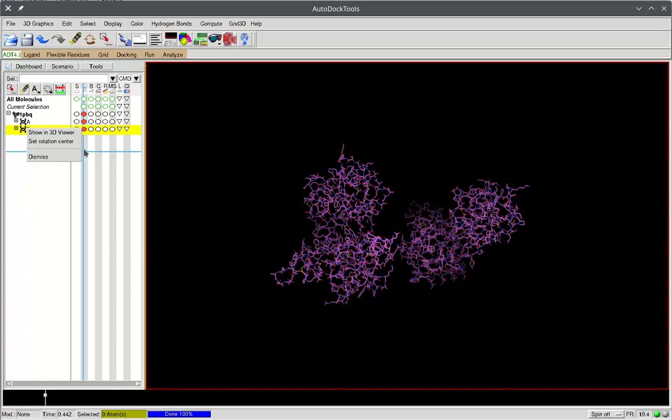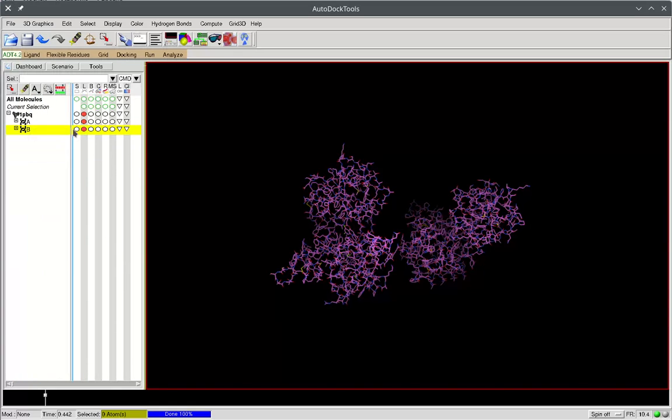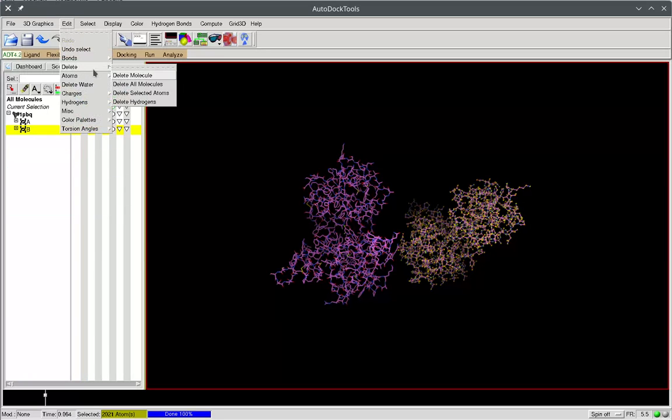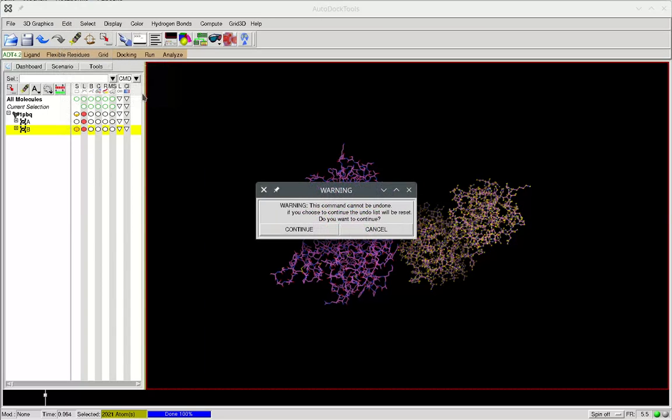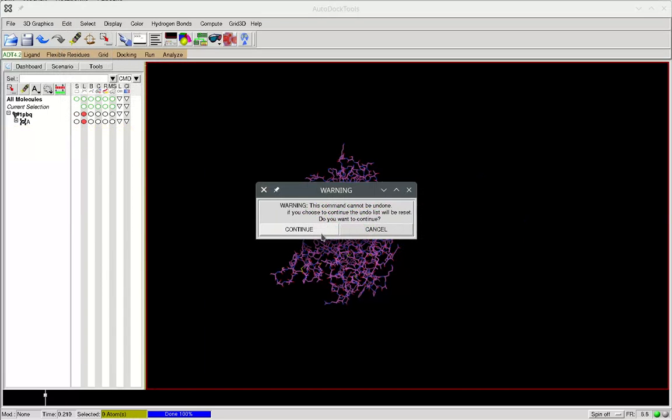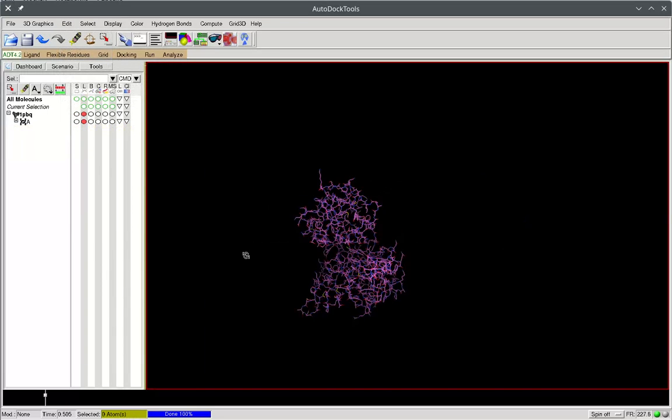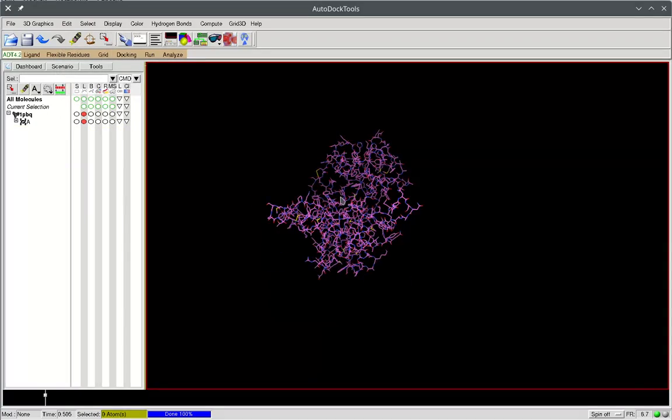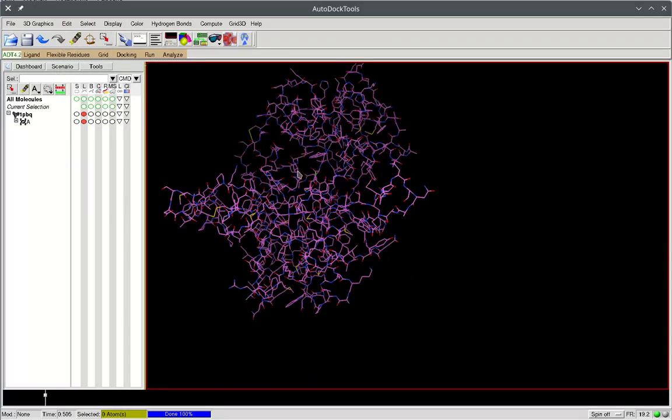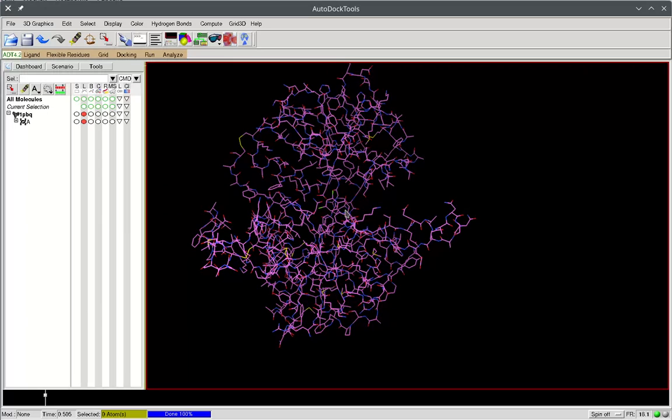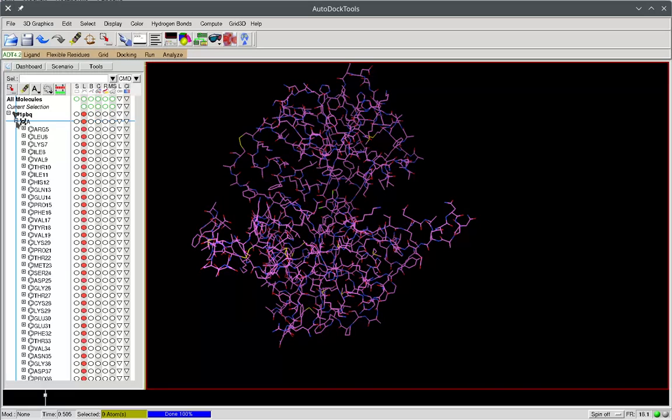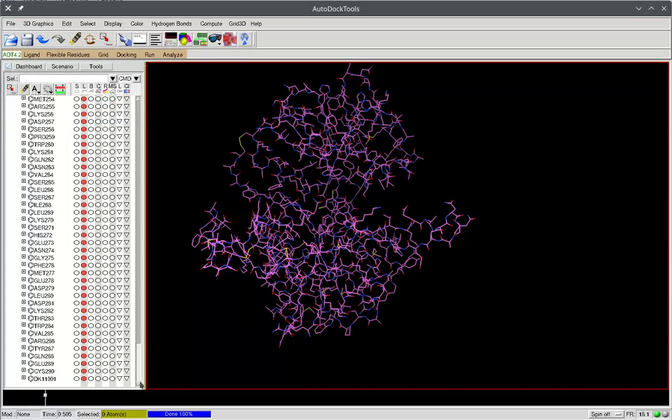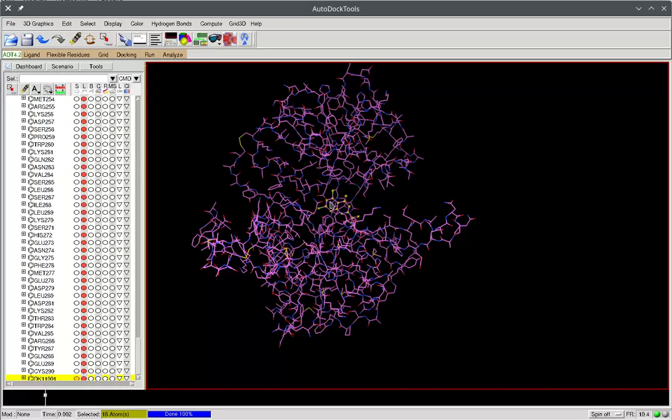So we need to select this molecule, go to Edit, Delete, and delete the selected atoms. The last point is that the receptor is usually crystallized with some sort of ligand. Because we want the ligand binding pocket to be free, we need to delete this ligand molecule. It's usually at the end of the chain, so we select this molecule.